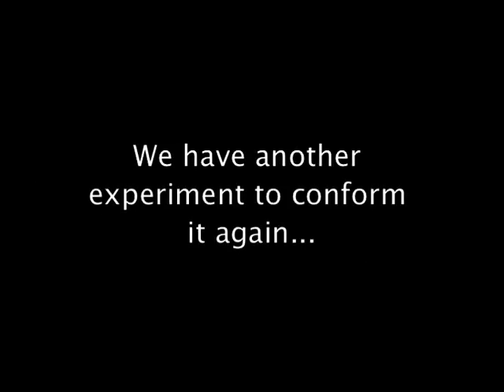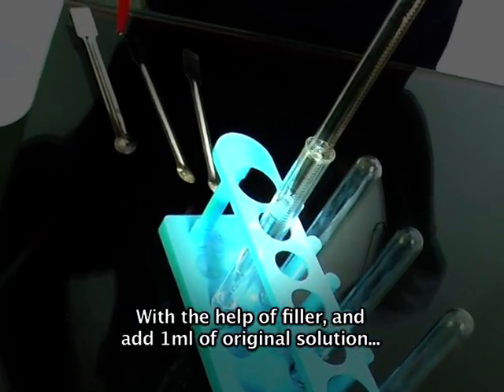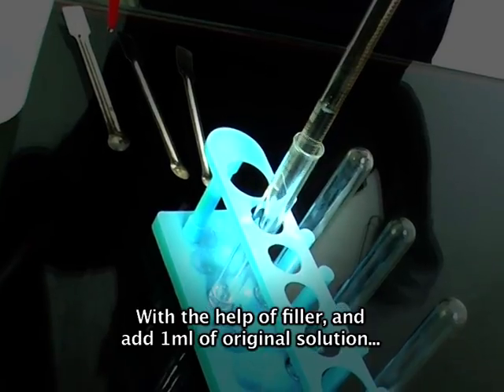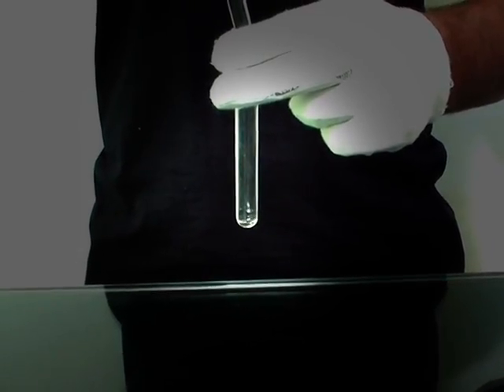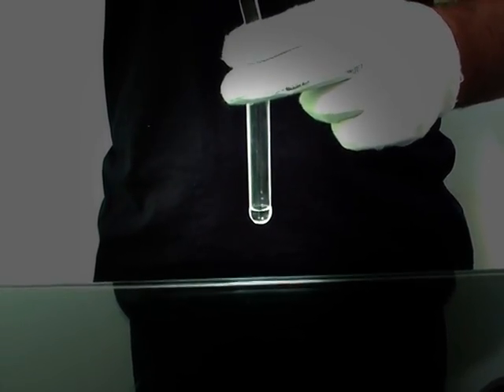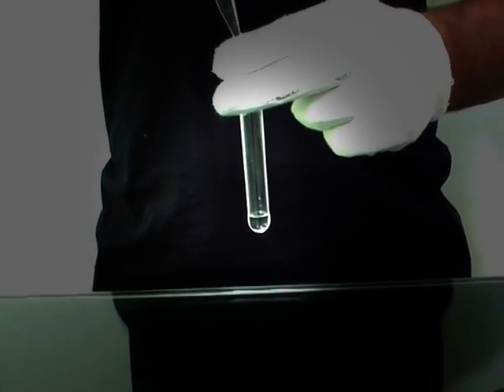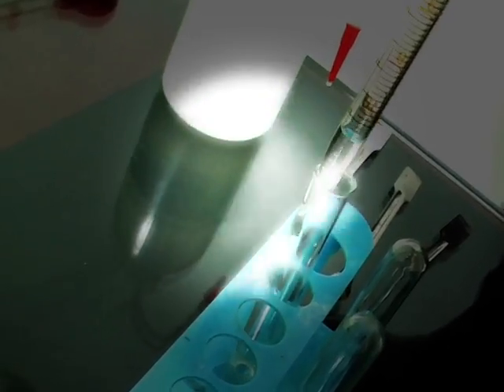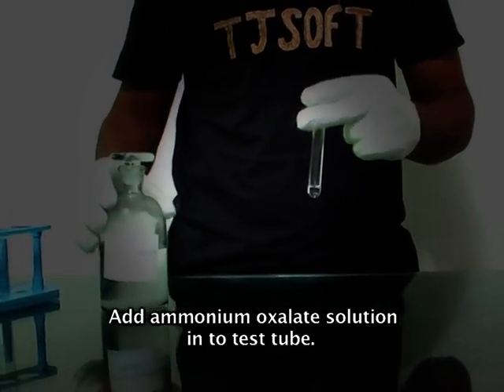We have another experiment to confirm it again. Take another test tube. With the help of a filler, add 1 ml of original solution. And add ammonium oxalate solution into the test tube.